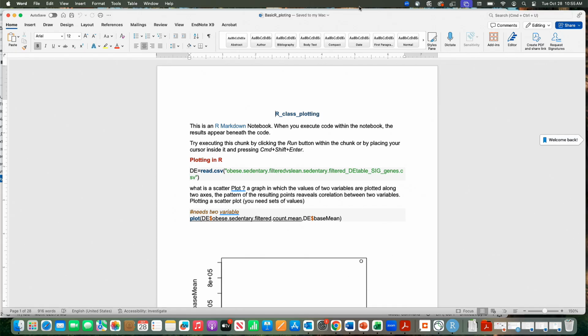It's in your Jupyter notebook now. From here we are going super fast, that's why I want those files to be there. The other file is uploaded. The ALL file is not getting uploaded. Why?